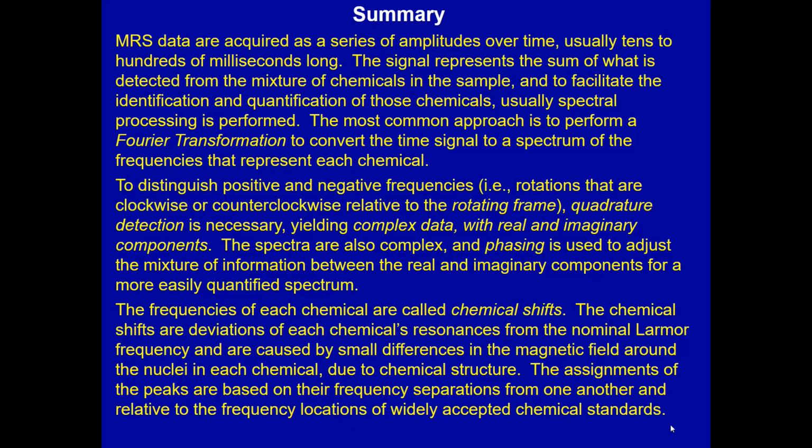But what happens is, when you see a signal at a particular location, you look at libraries. Now this used to be paper records of spectra for all kinds of chemicals kept in the chemistry library. Now you can find lots and lots of chemicals online in different databases. You look up the chemicals you suspect it might be, that we already know from other methods before NMR was used, that there's glutamate in the brain, for example. You go looking for what might exist in the brain and try to find those chemicals. When you find what you think might be it, you buy or make some of that chemical, dissolve it in solution, and measure that and make sure that it could still explain it.